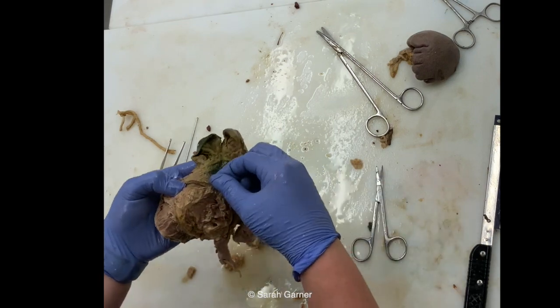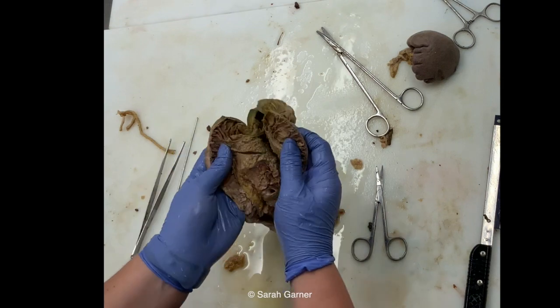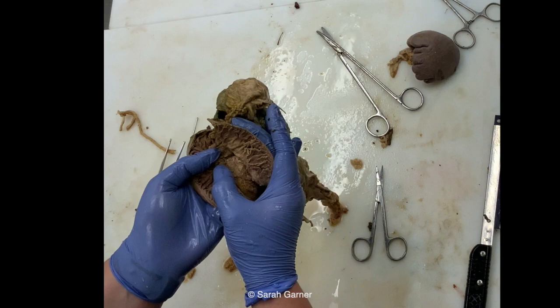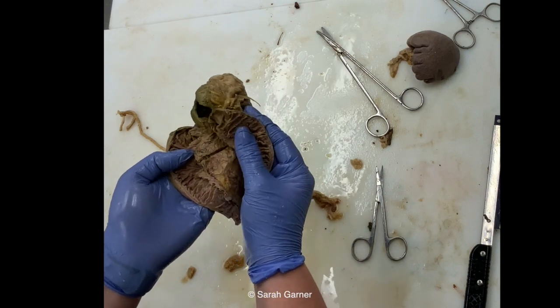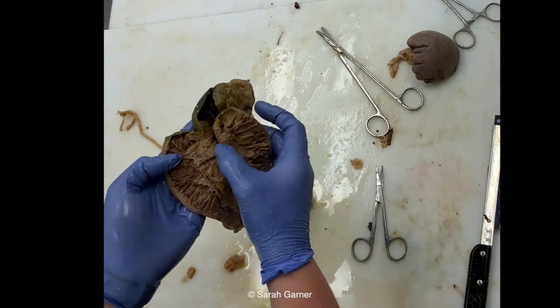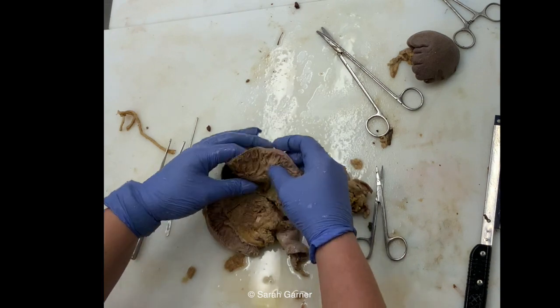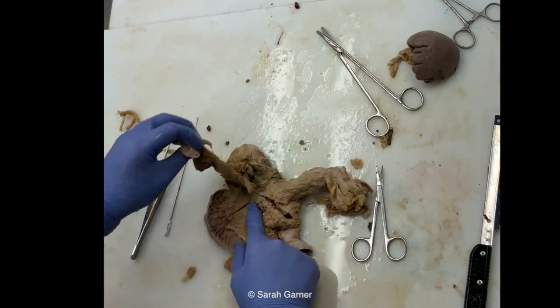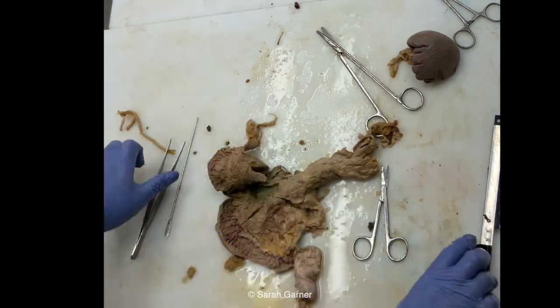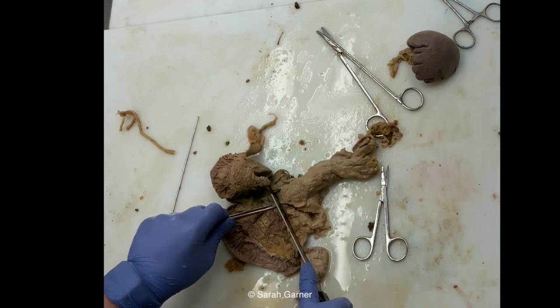So here's our duct. From this view, to orient you, we've got inside the duodenum, we've got the ampulla of Vater, major duodenal papilla. We've opened up that pancreatic duct nice and wide now, but there's the other half of that. So this would be an important section to submit, and then the rest of it you can serially section. You could add a couple cuts there if you want. But essentially, you're just going to section through the rest of the pancreas like this.